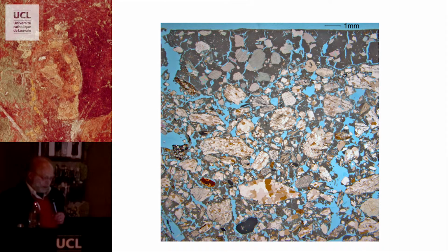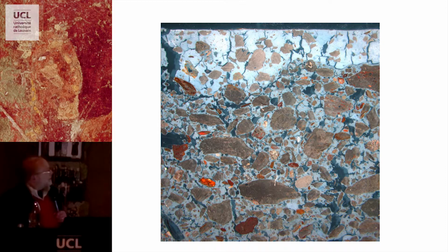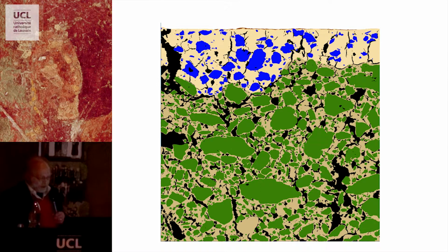Another example, here very striking, the high density of the intonaco. Same principle. I'm just showing you some selected examples from Ephesos because, to make it quick, we have found no significant difference or significant change of material or application techniques through times or through rooms there.